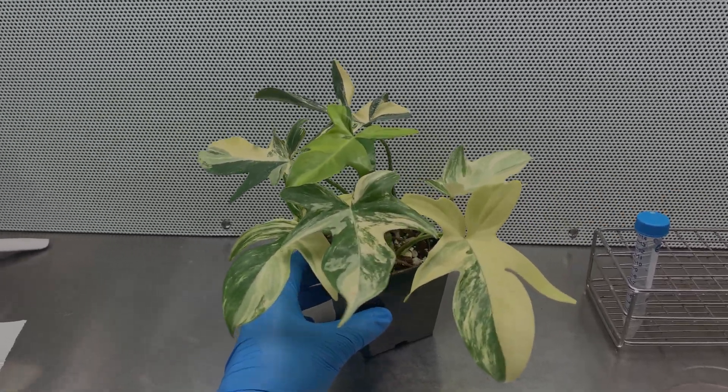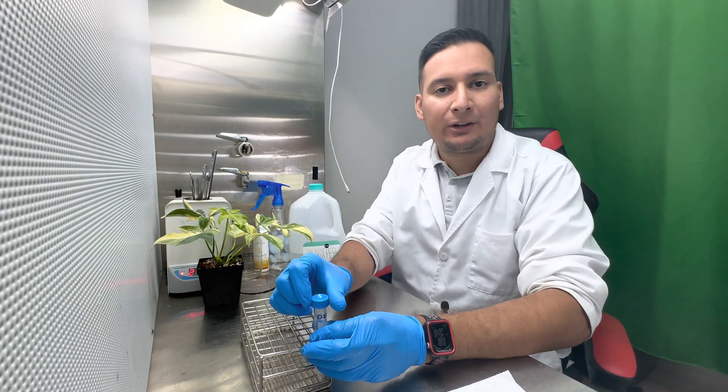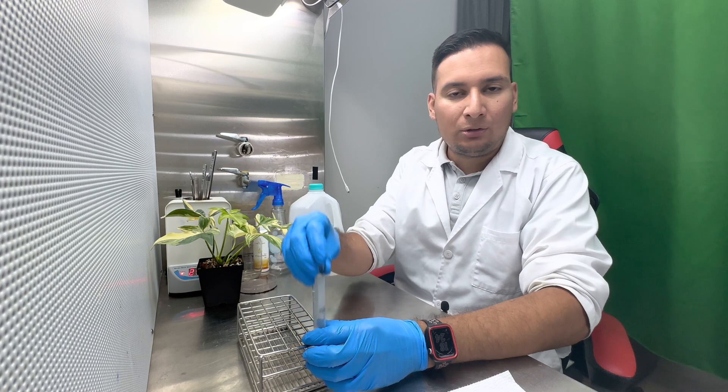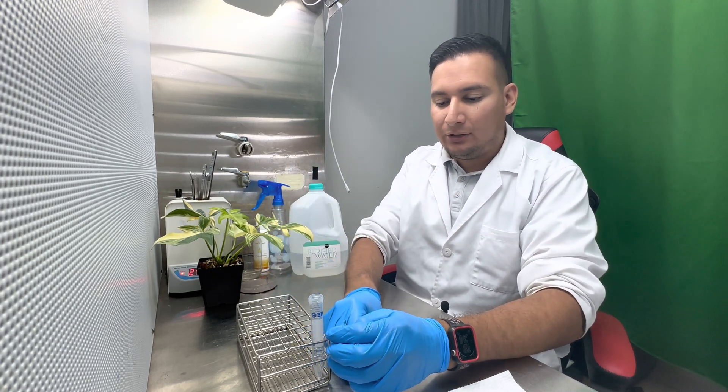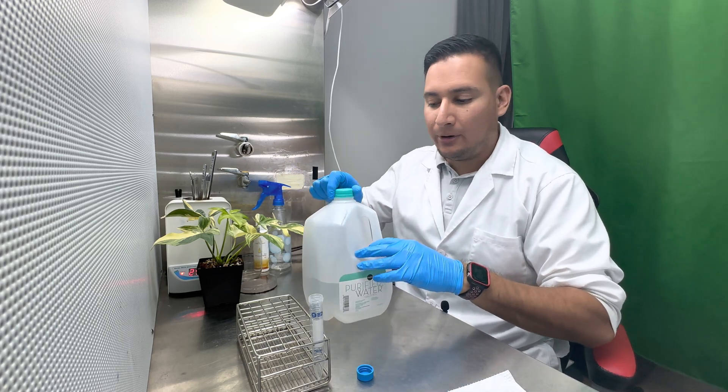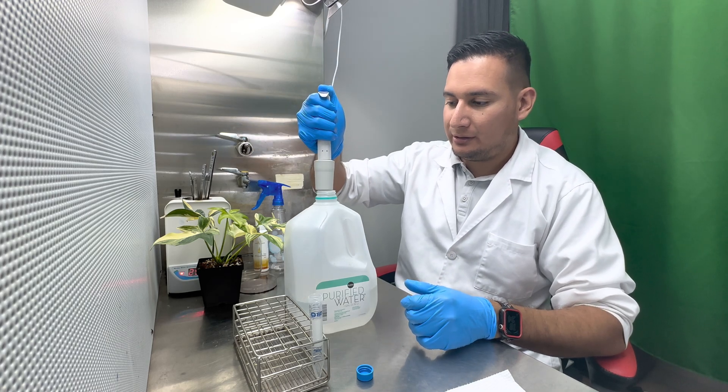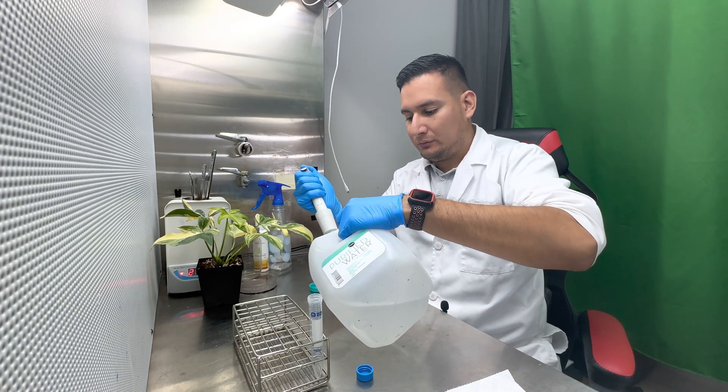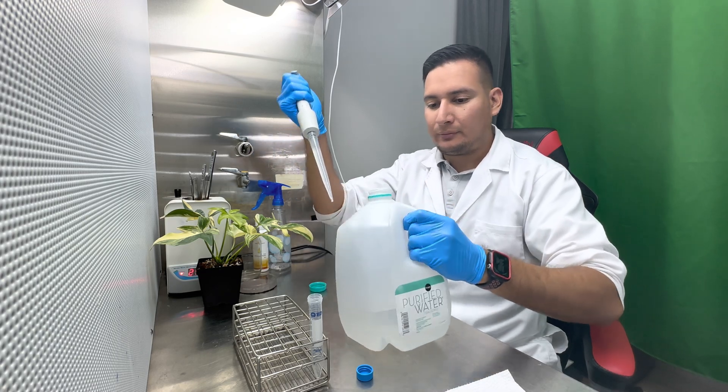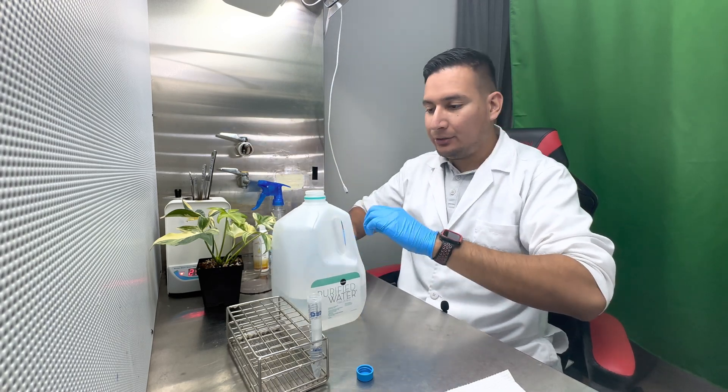So let's get started. The first thing I'm going to do is make my sterilizing solution. I want to use a small test tube because I want to take a small cutting. I'm going to take nine milliliters of distilled water.